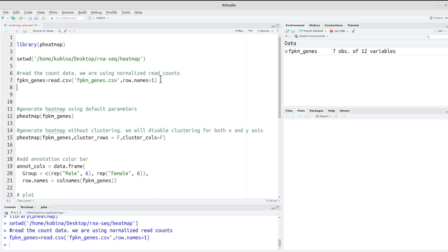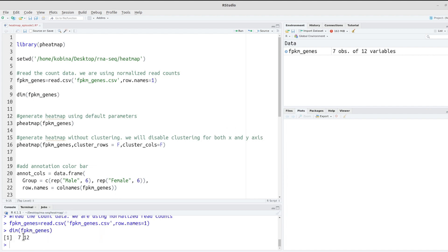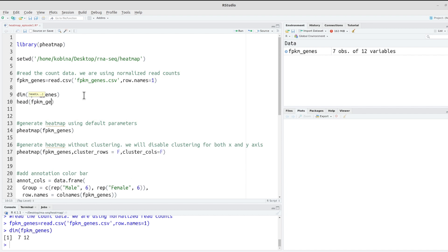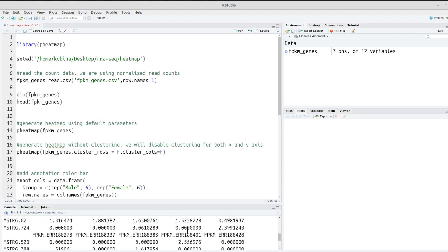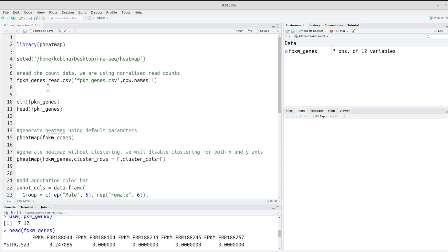My data is loaded. I'll start with a dimension check — I'll call dim() on fpkm_genes. The result is 7 by 12: the 7 represents the rows, which are the genes, and the 12 represents the columns, which are the samples. I can also do some further exploration, but let's proceed with the actual work since we are working with a small dataset.